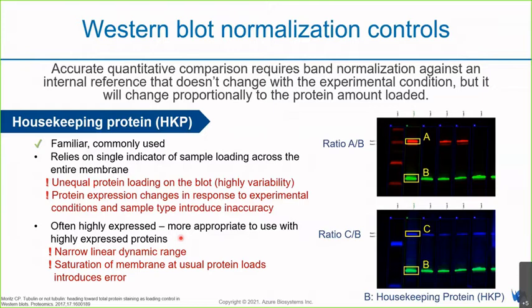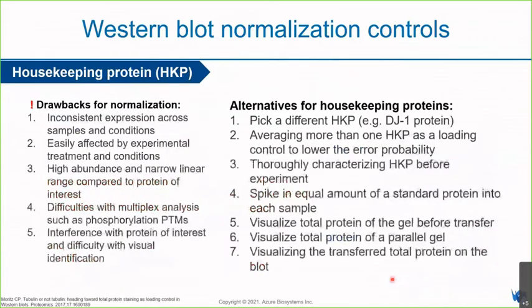normally when you have a Western blotting protocol, and even a loading amount, that is optimized for a very lowly expressed protein of interest, your housekeeping protein, which is highly expressed, will often overload and oversaturate the membrane. Thus, you are no longer able to detect the differences between the sample loadings. This is a list of drawbacks of using housekeeping proteins as a normalization control.